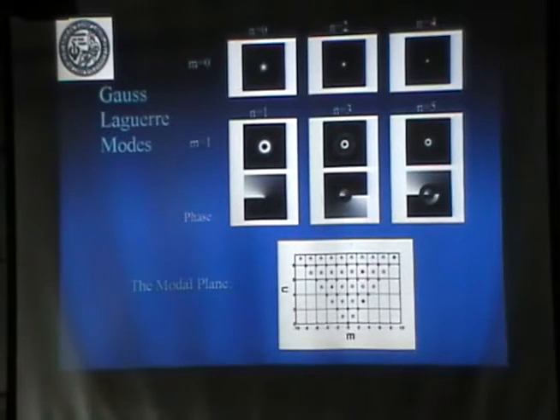In order to do that, we use this Gaussian basis. So this is 0,0, which looks like this. And then as you increase n, the contrast is not good here, but you get rings. The higher the n number, the more rings you have. And then m gives you the donut. The higher m, I don't have it here, because this is an infinite set of functions, the bigger this hole is. And it's bigger because the phase has multiple jumps around the center.